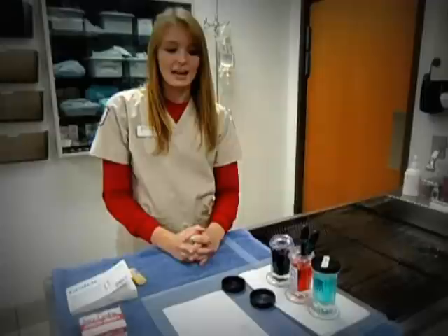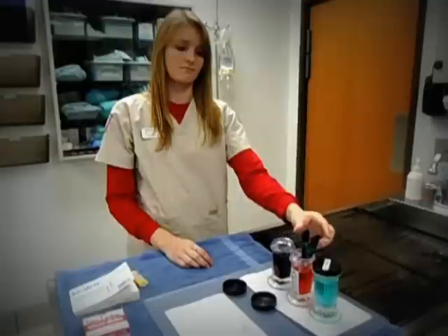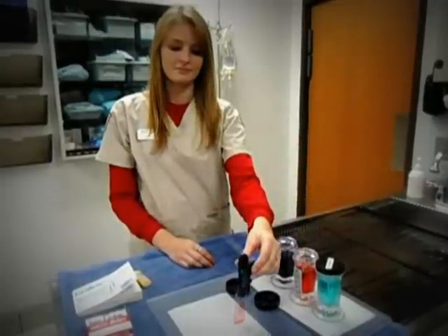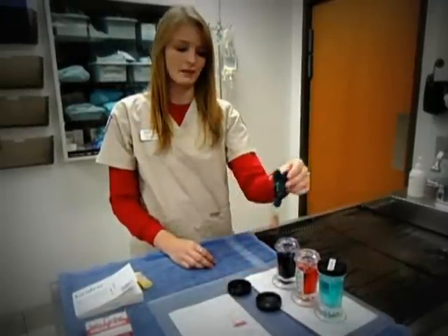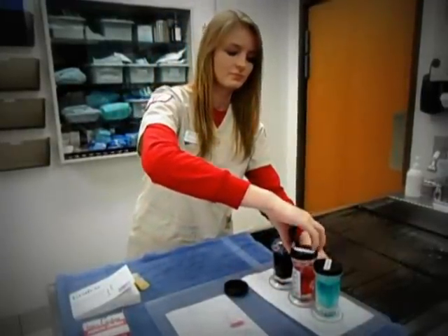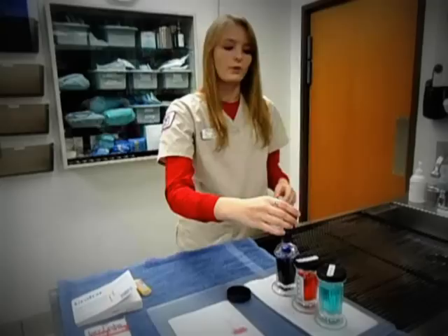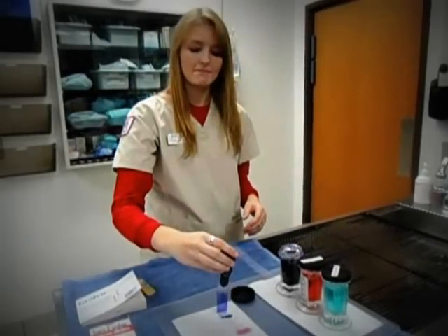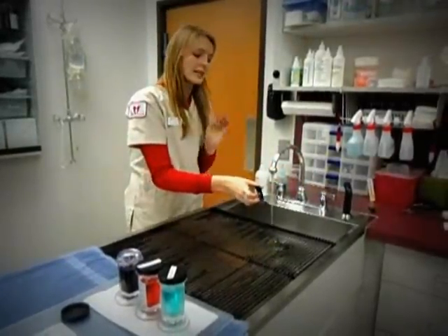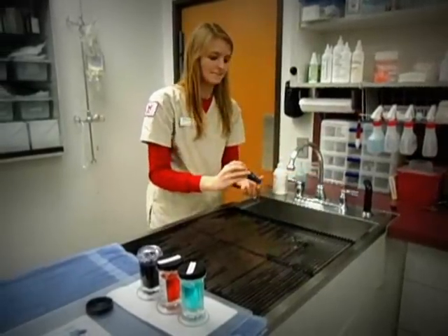The second and the third stain act as staining and they stain certain things inside the cells. When I'm done with my last stain, I dab once again and take it over to the sink where I run some light water over the side that doesn't have the sample on it. This takes off any excess stain that I don't need.